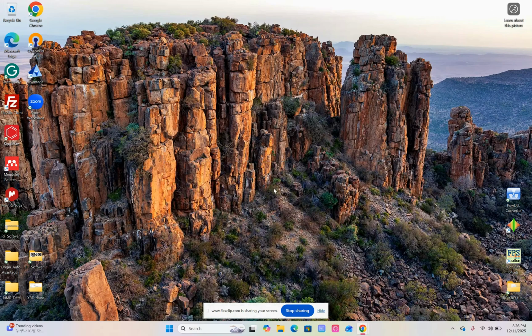Hello everyone, this is gonna be a tutorial on how to run Rietveld Refinement for evaluating your XRD pattern. We are gonna start from the very beginning. That means I will introduce you to the software which is required for running the refinement, how to convert your raw data into a file suitable for the software, and how to perform the refinement itself.